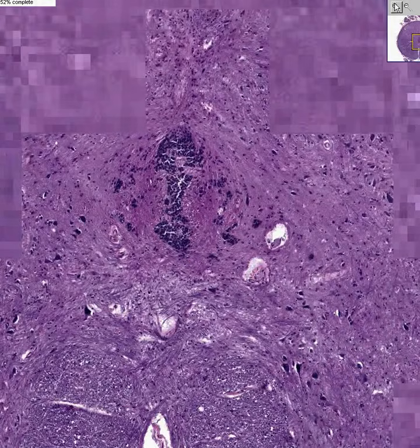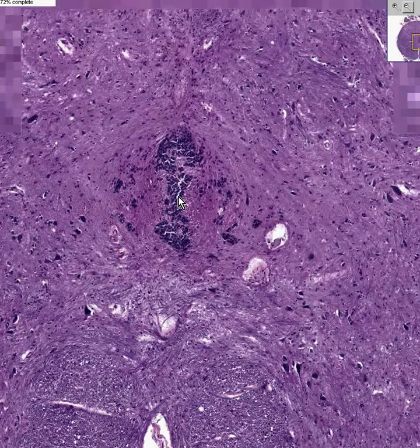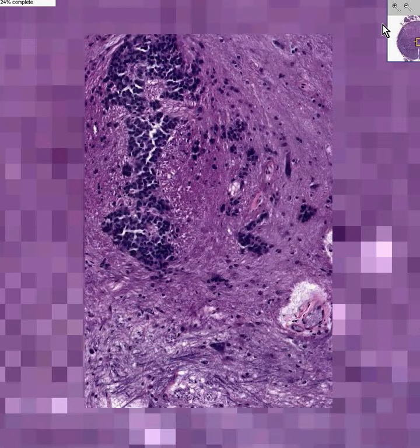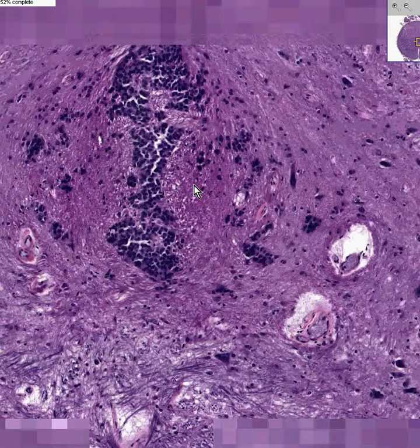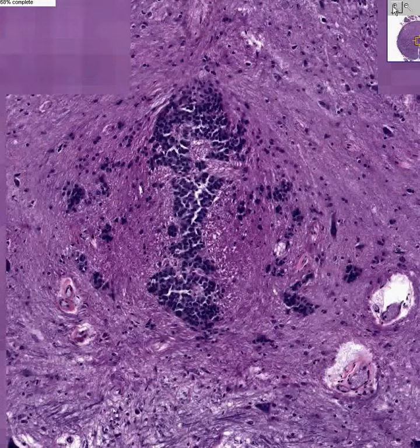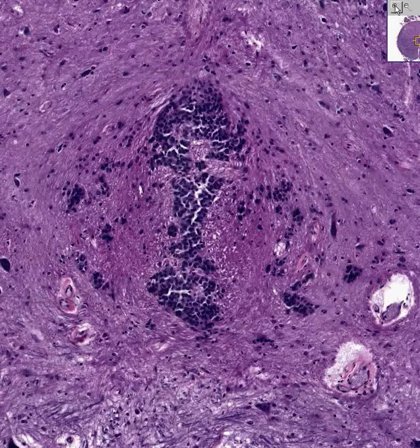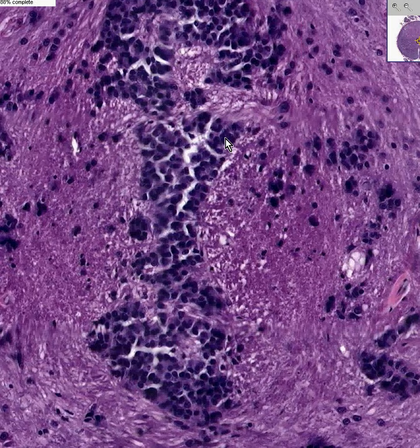And we can show you that these epithelial-looking cells, which apparently are lining a very small lumen, are indeed your classical ependymal cells. And they are the only type of the 5 types of glial cells which look pretty much like a simple columnar epithelium. These line the entire ventricular system as well as the surface of the choroid plexus, which makes the cerebrospinal fluid. And now, I thank you very much.